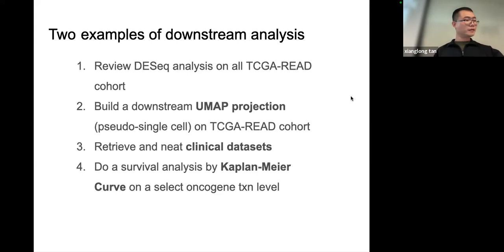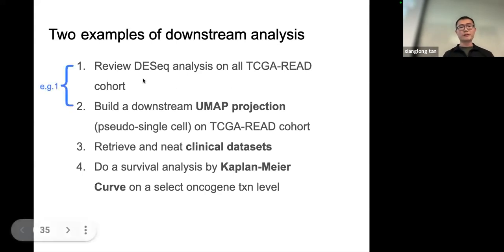So today, I will also use two examples to show you how to perform some downstream analysis with the data sets that we retrieved yesterday. We are also going to use the same transcriptional data sets we downloaded yesterday. The first example will use the DESeq pipeline again with our transcriptional data sets.